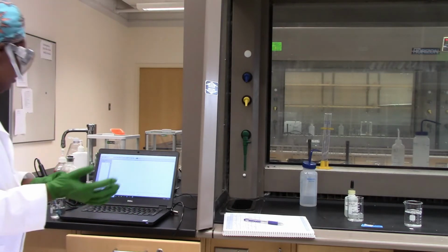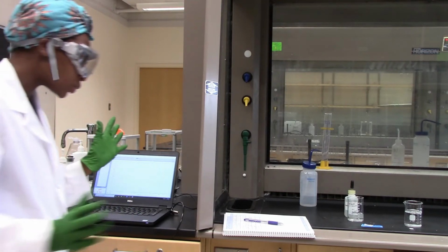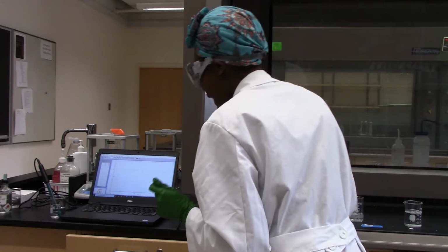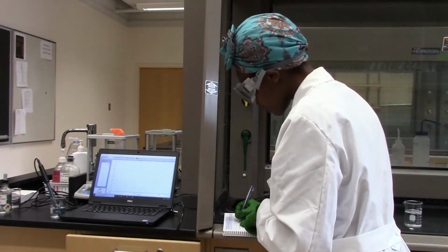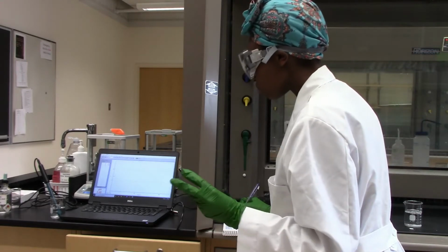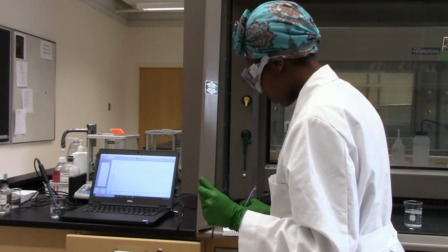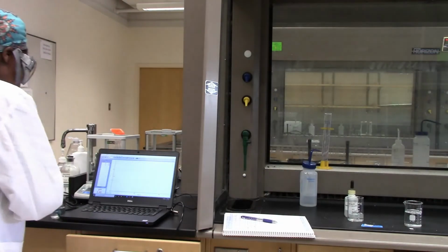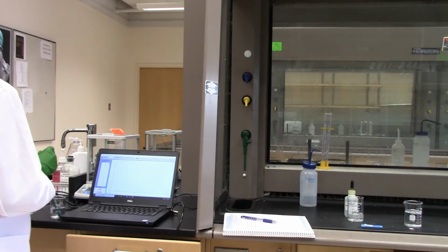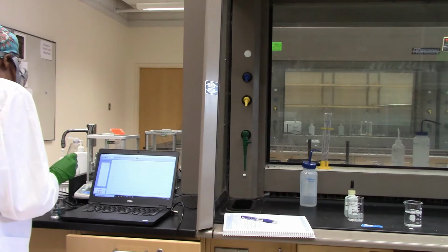Interestingly, that changed from a 7.29 and now we have a 3.50. And now I'm going to add 1 drop of HCl. Just 1 drop.